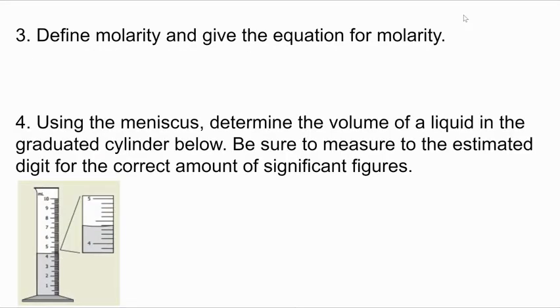Define molarity and give the equation for molarity. And then, using the meniscus, determine the volume of liquid in the graduated cylinder below. Be sure to measure the estimated digit for the correct amount of sig figs.